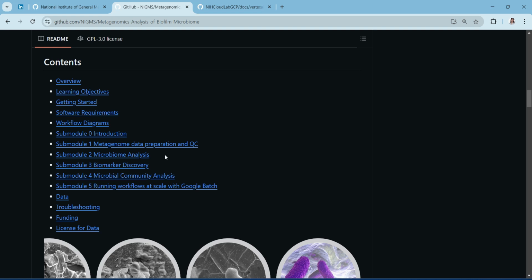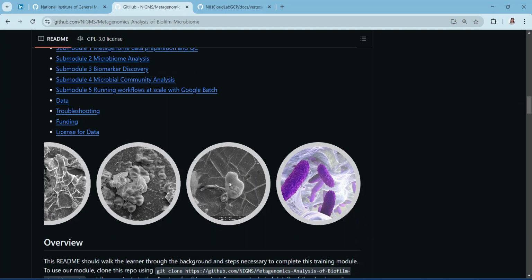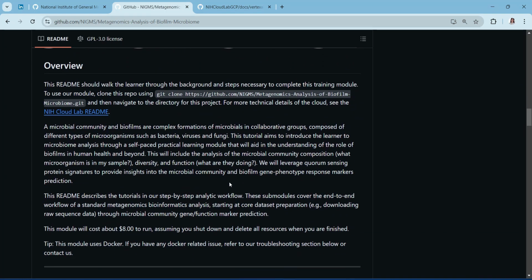Then you will learn how to discover biomarkers within the biofilm microbiome data, and the last section will teach you how to scale your workflows using Google Batch, an essential skill for handling large data sets. For a detailed explanation of what you will learn in each submodule, please refer to the videos that are hyperlinked within this course. Now let's talk about how to get started with this module.